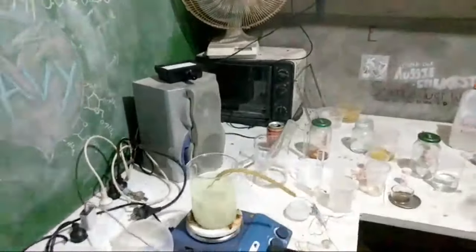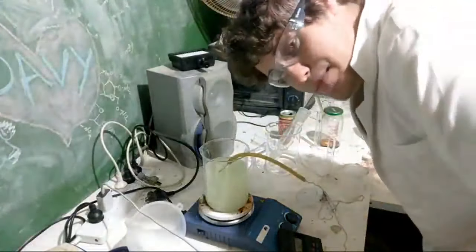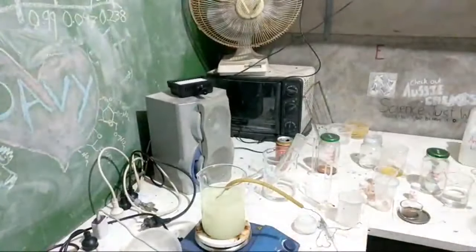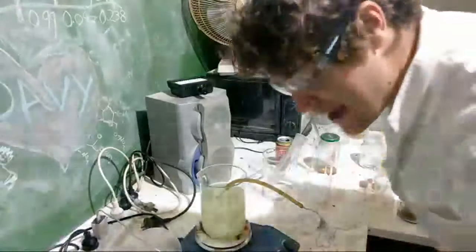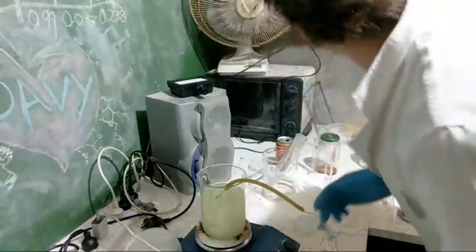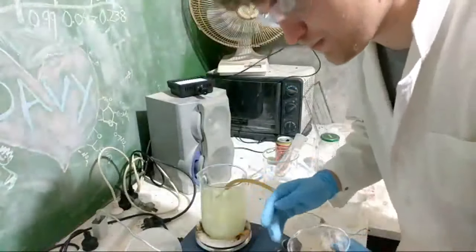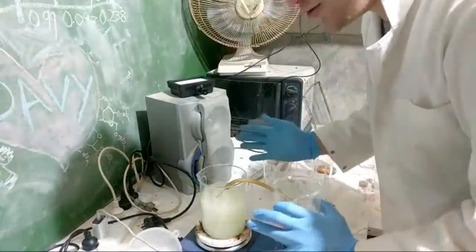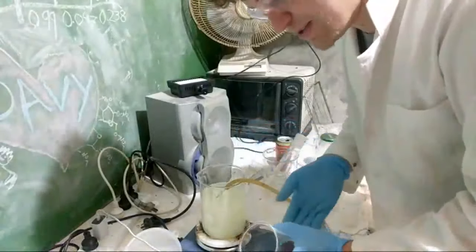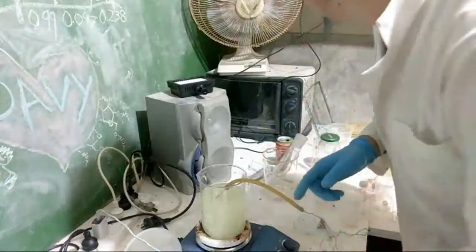Alright, chat. This is a big moment for you because you get to decide how this chemistry is going to go. Now, should I just dump all the iron oxide into this basic bleach and we'll just see how we go? How's that sound? Because how bad could it be? If everything cocks up, we've used no real cost of reagents. The bleach barely costs anything, the iron oxide is self-produced, so that's really easy, and the potassium hydroxide, I've got heaps of that, so that's fine.